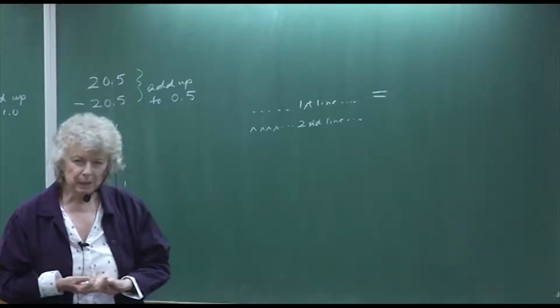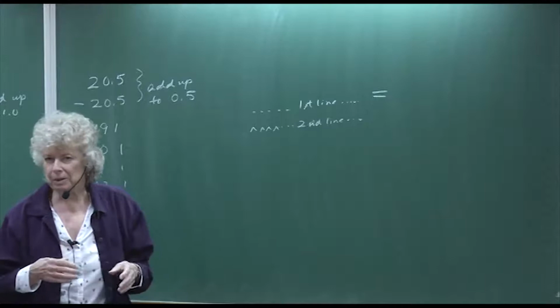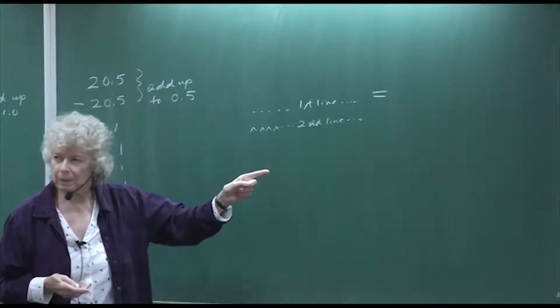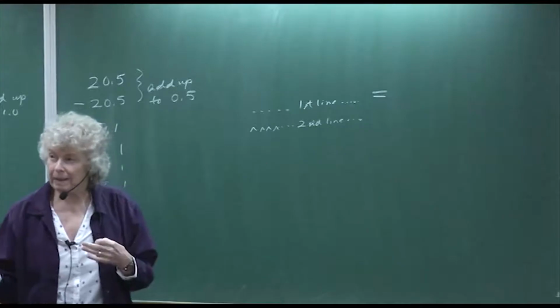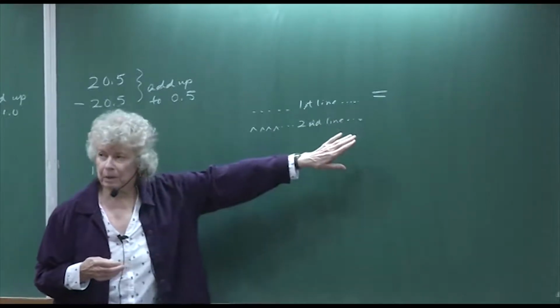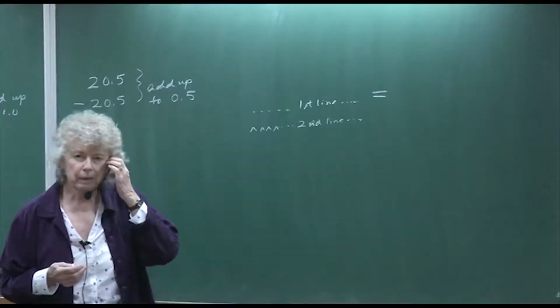And then a really quick and dirty way to go backwards from anisotropic to isotropic is to just delete that equal sign, which you can do with the replace command. If you get rid of the equal sign on an anisotropic thermal ellipsoid, it will go back to isotropic. So that's one way you can do it quickly.